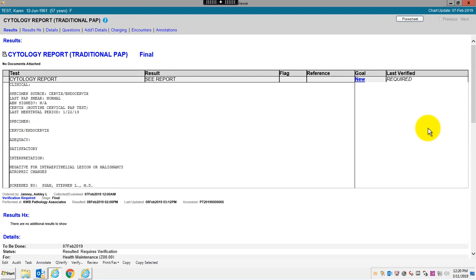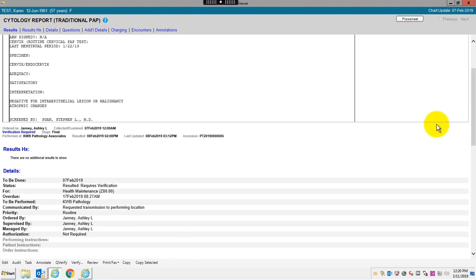And then the second section, usually indicated by a diagnosis indication or a specimen and interpretation indication. That will be the second section, and then many times below that will be other, more detailed microscopic or gross description of the specimen.